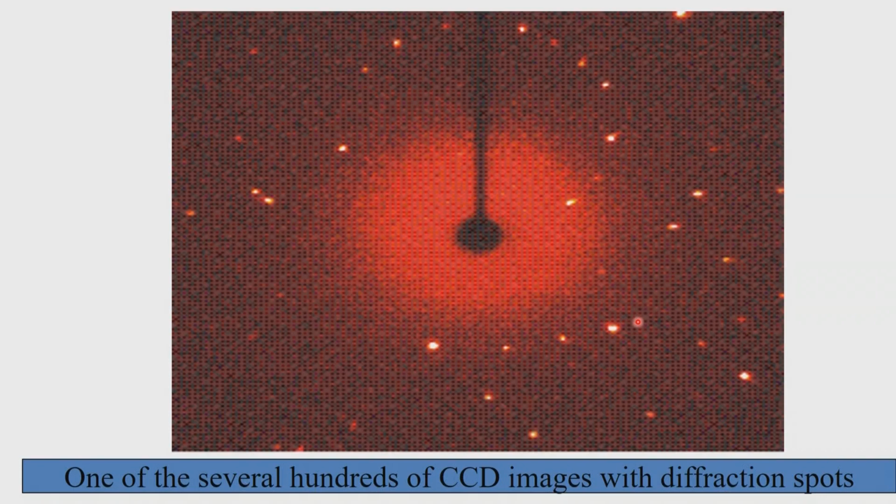The amount of time we spend to collect each data point is pre-decided by us, and that depends upon the quality of the crystal and the extent to which we are looking for reflections in the reciprocal plane. So, if we want to go to the end of the reciprocal lattice dimension, which is the limiting sphere, we would like to have a good time of exposure, and this exposure time also depends, as we have already seen, on the f versus sin theta by lambda curve. So, at smaller angles we will have higher intensities, at larger angles we will have lower intensities. So, the exposure time accordingly we can change, we can go from a smaller 10-second data collection to almost a minute data collection if we are collecting at very high angular range.